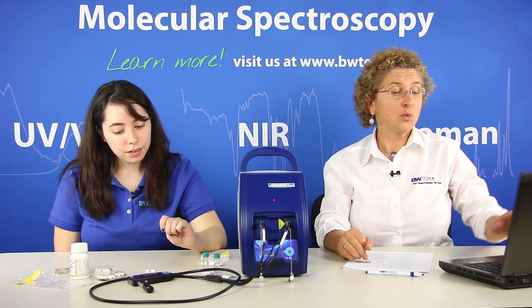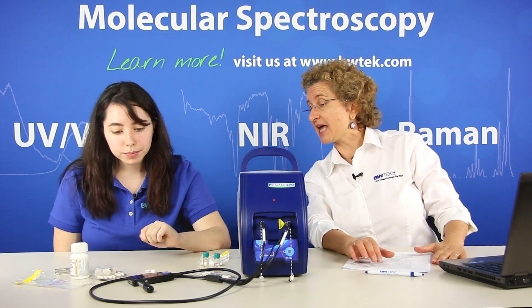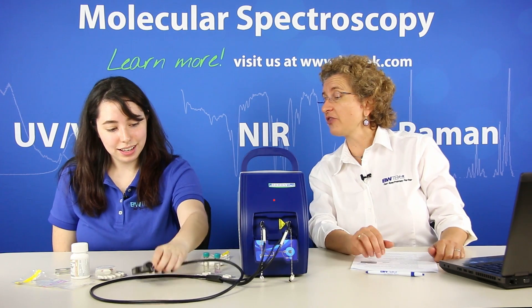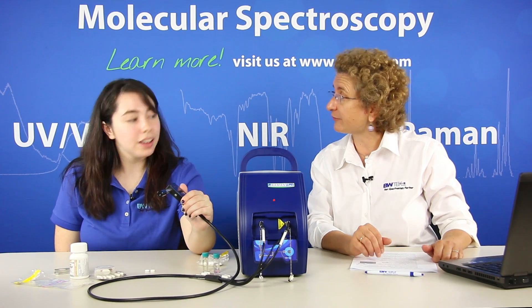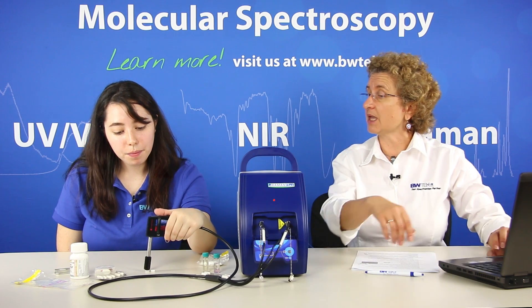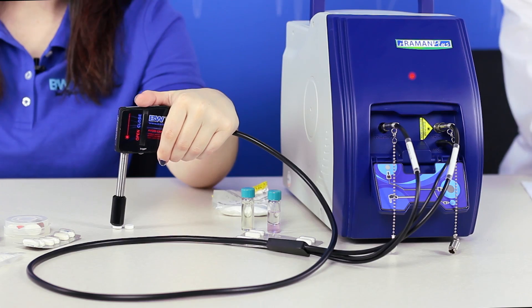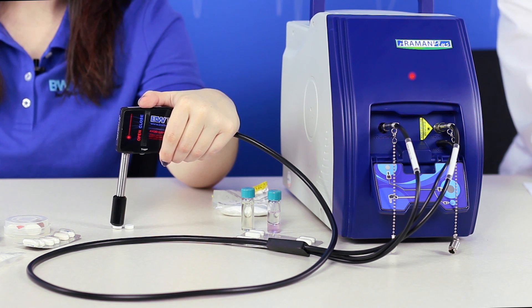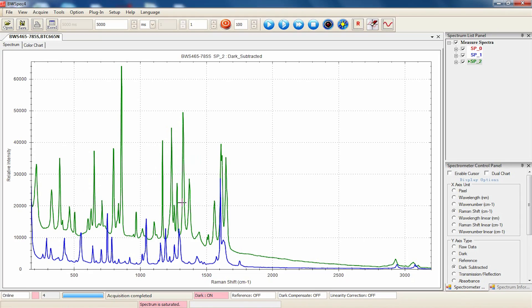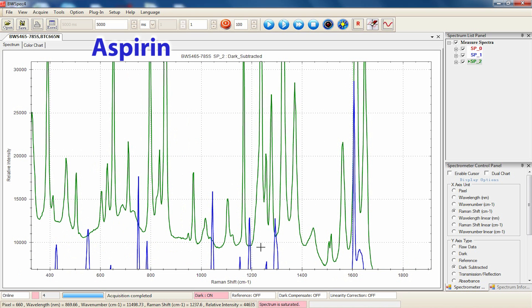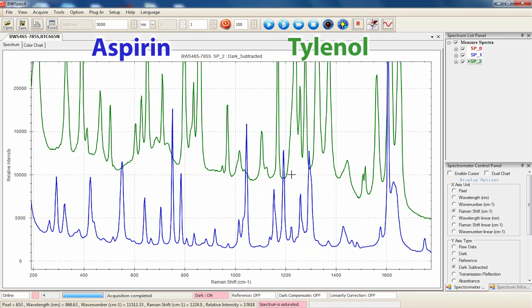Your first material — we're not using a library here, but it looks like that might be aspirin. Correct. And you have another material, so we want to see if that one's different from the first. So let's go ahead and put the probe against the sample and measure that spectrum. Here we see that we now have two spectra overlaid — of your two materials. They're really quite distinctly different, one from the other. So we have the fingerprint of your aspirin tablet and of your Tylenol tablet. With the library, we could then have it automatically identify what these materials are — it's a great way to identify things quite rapidly.